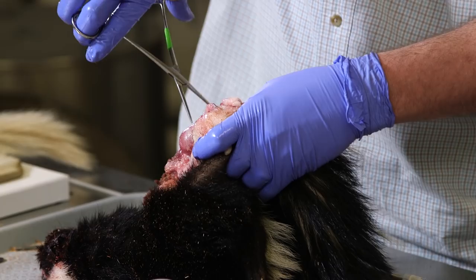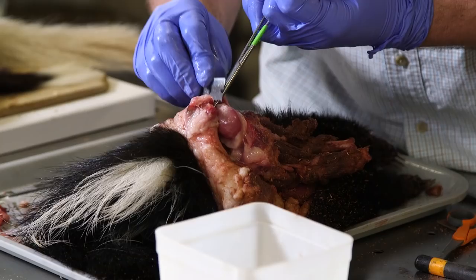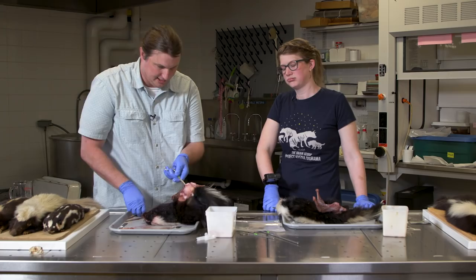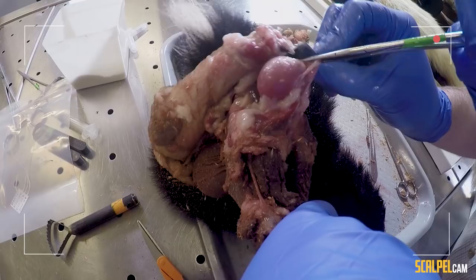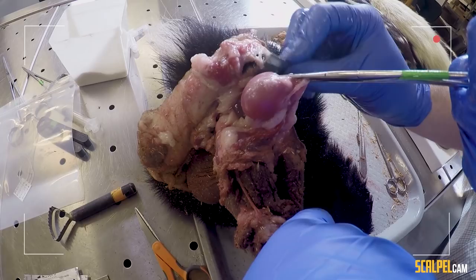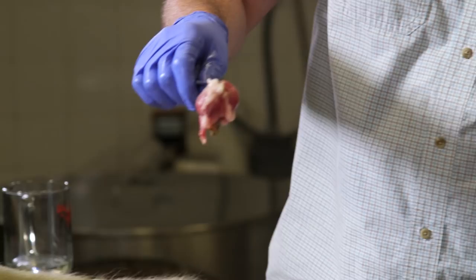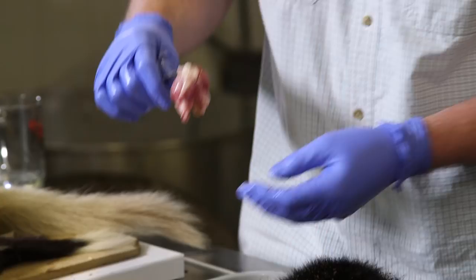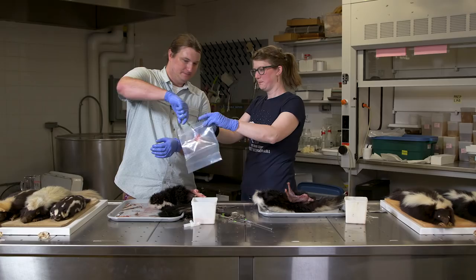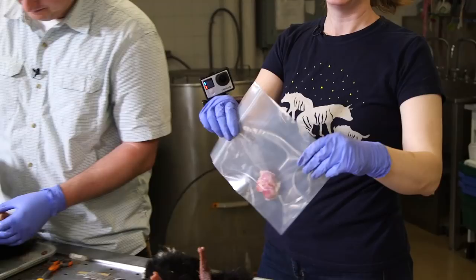Now we've got the clamp on. This is the moment of truth — we're actually going to cut through the external opening and the anus, and hope we don't rupture anything. There's the anus. Oh — we got a little feces. What did this thing eat? He was eating garbage. There they are — sealed up! We got the goods.